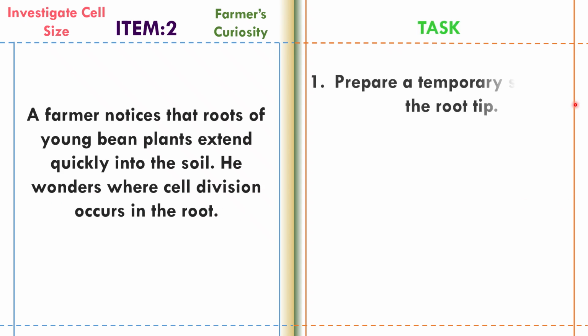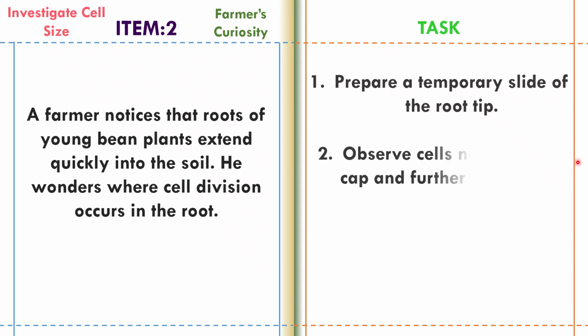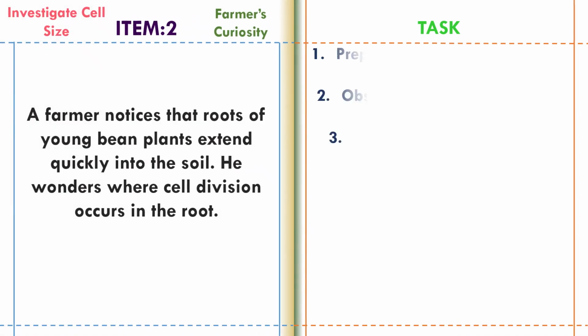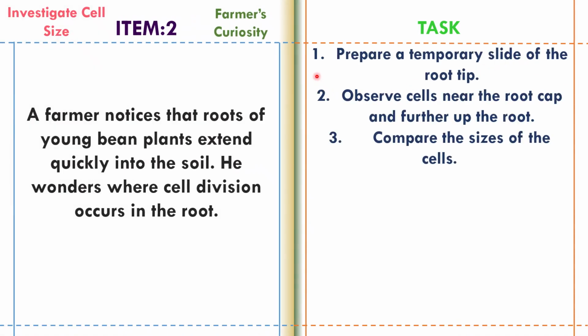Tasks: prepare a temporary slide of a root tip; observe cells near the root cap and further up the root; compare the sizes of the cells. Let's prepare a temporary slide from the root tip.